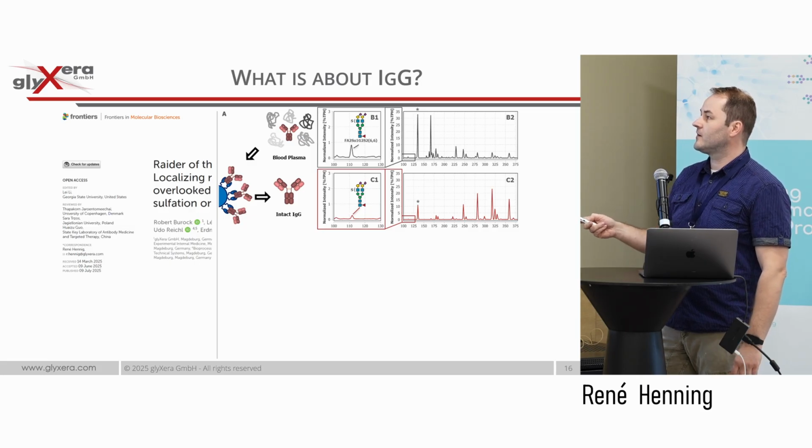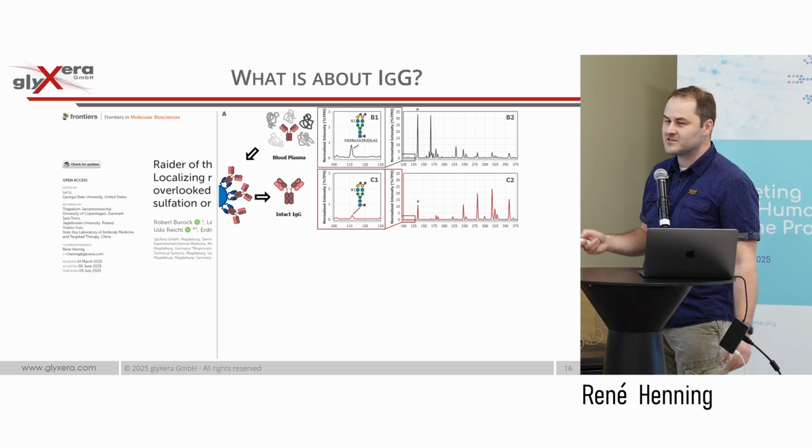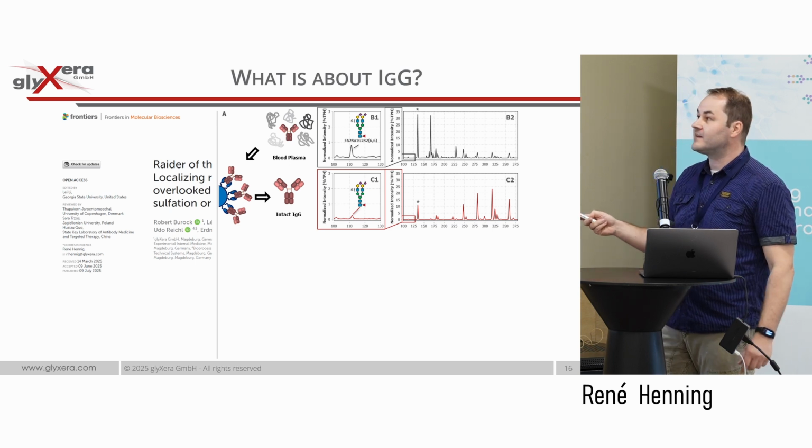We took the blood. We captured the IgG in blood, you see it here in the beginning, and also an IgG even smaller here, 0.01%, 0.02%, depending a little bit on the patient. It's a really, really tiny peak, but it's there.